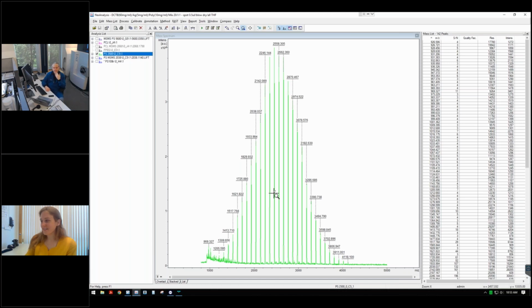Thank you. All right, following that question, what is the minimum required amount of sample for examination? For polymers, I would say on target, really you only need about 10 milligrams, and that makes a mil of solution. And then from that, we're using 2 microliters.